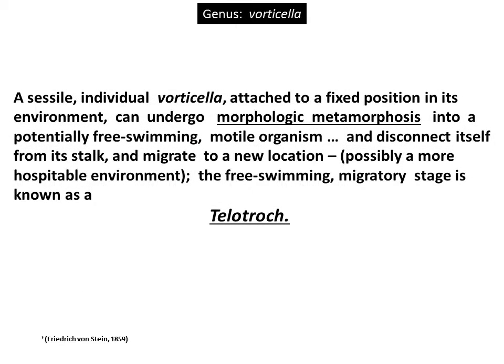A sessile individual vorticella attached to a fixed position in its environment can undergo morphologic metamorphosis into a potentially free-swimming motile organism and disconnect itself from its stalk and migrate to a new location, possibly a more hospitable environment. The free-swimming migratory stage is known as a telotroch.